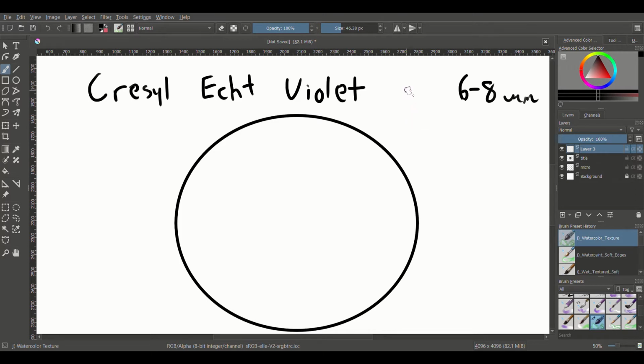So with this stain, what we're going to do is essentially stain everything with Cresyl Violet, which is a basic dye. It's going to stain the Nissl substance, which is basophilic, as well as nuclei. The balance we have to strike is that we want to show the Nissl substance, but also contrast that with everything else in the background.